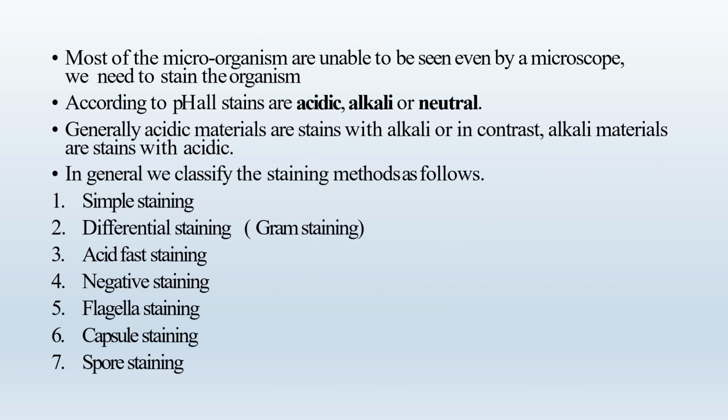So when we are watching microorganisms under the microscope, we need to stain them to differentiate between them. According to the pH, all stains are either acidic, alkali or neutral. Generally, acidic materials are stained with alkali stains, while in contrast alkali materials are stained with acidic stains.